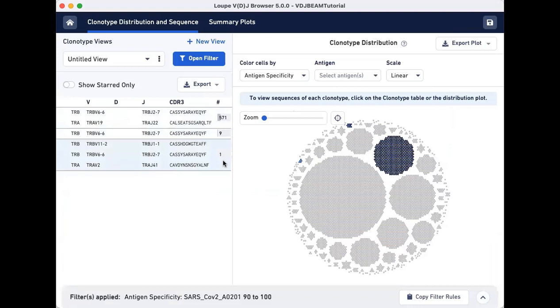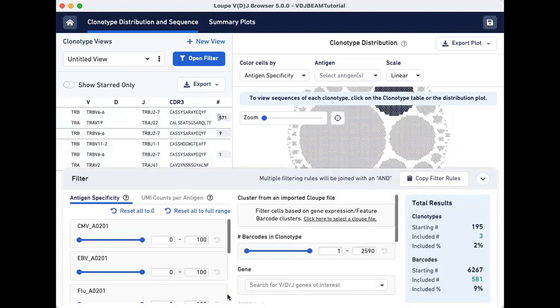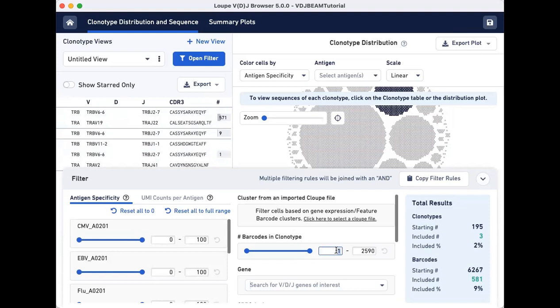To filter out smaller clonotypes, use the middle panel of the Filter menu. Here, you can change the minimum number of cellular barcodes to 50.